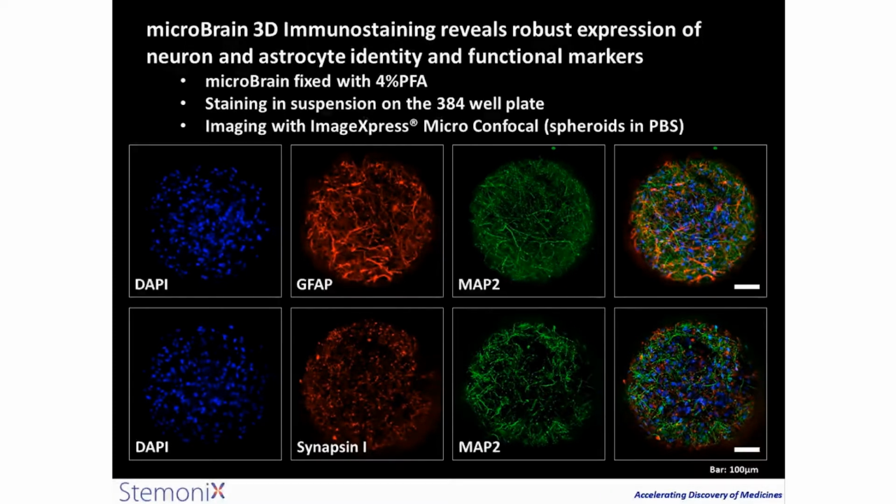information from this platform. What I'm going to show now is a video of this platform, also captured through the ImageXpress confocal, a time-lapse of the calcium oscillation.